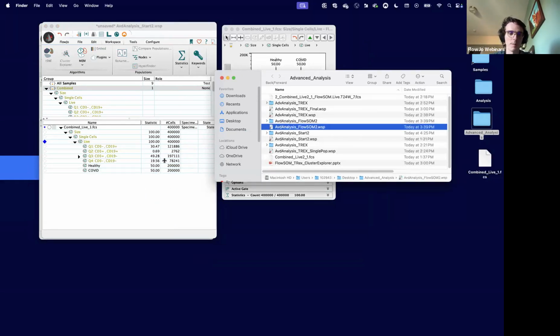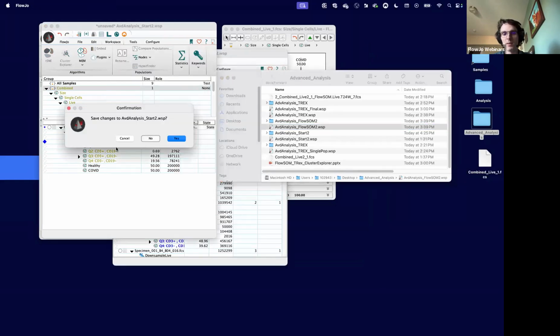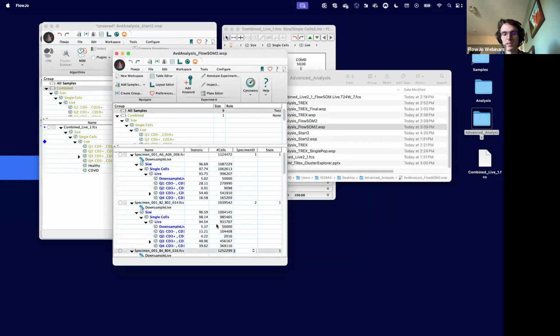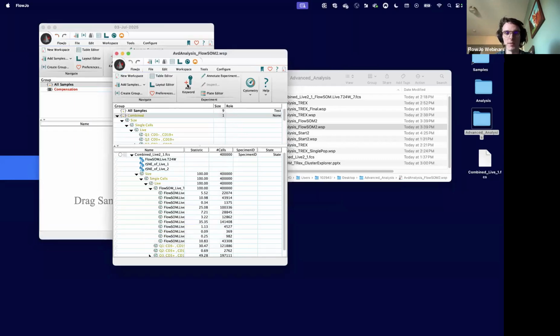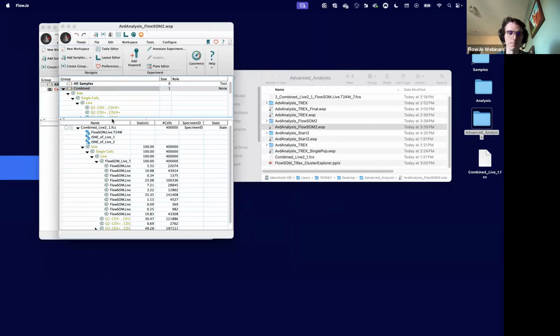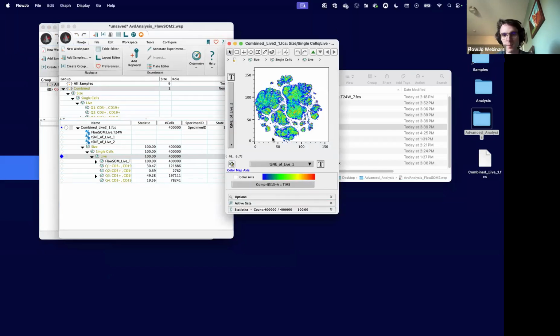It's this second workspace where I've already saved the t-SNE results. I've already run the machine learning and generated the second workspace just so we don't have to wait. I ran both the t-SNE and FlowSOM, so I will show FlowSOM, but I already have the results secretly done here, so we don't have to wait for them. When t-SNE finishes running, it will return results, and the results will look like this.